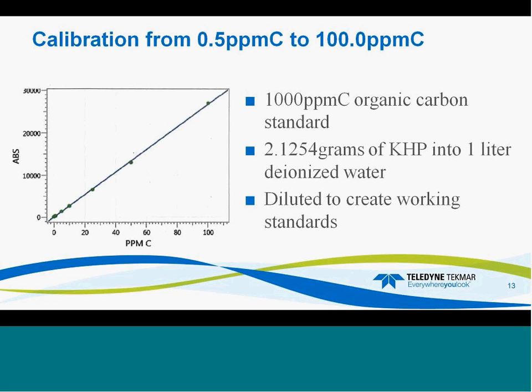This calibration is showing 0.5 to 100 ppm. Easy. You can remove points if you need to. You can add them back in. You can save it.